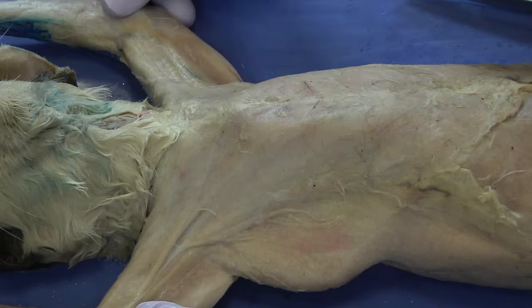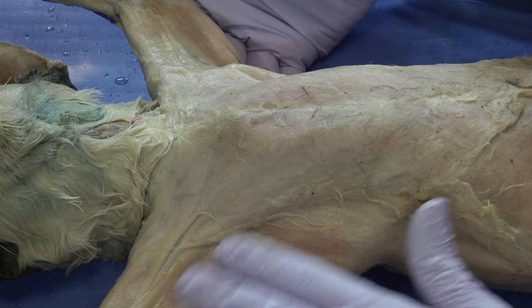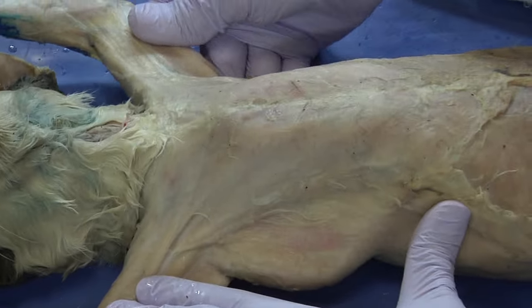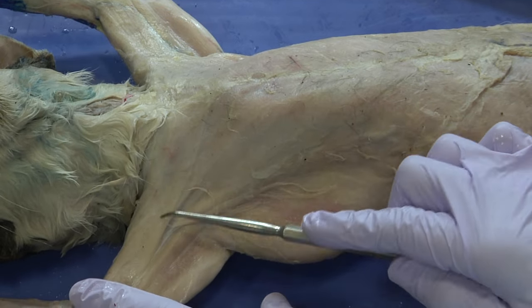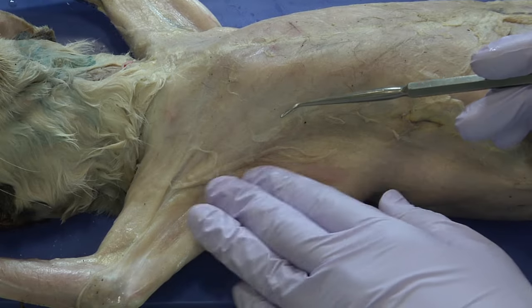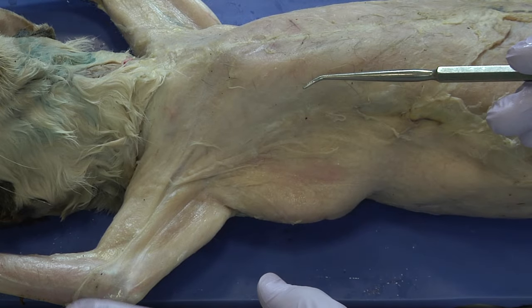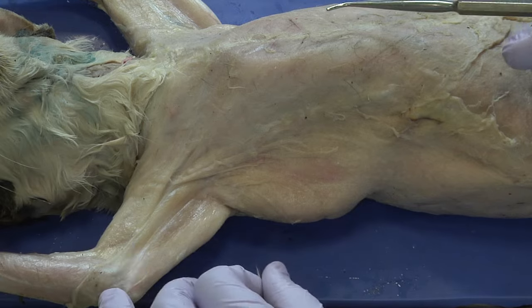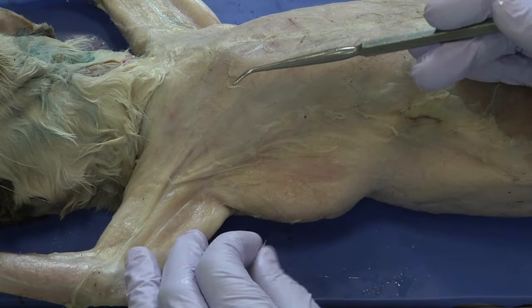Now that the cat's chest and upper arms are clean of connective tissue, you can begin to see the muscle pattern and how it's striped. That was the level of removal we wanted. The next step is to delineate and isolate the muscles from one group to the next.